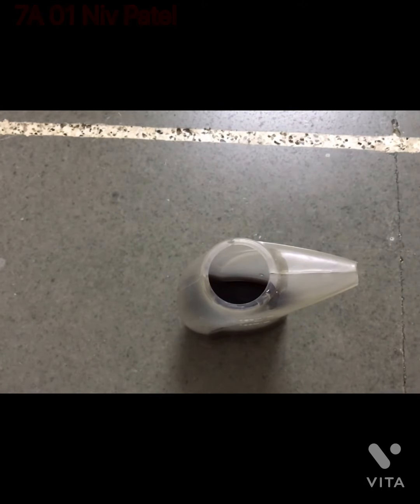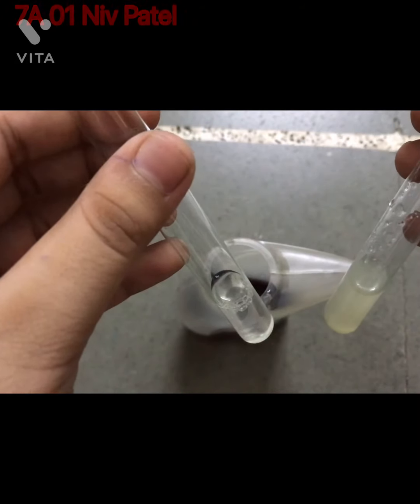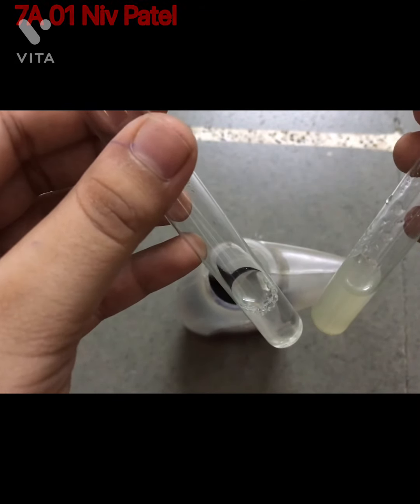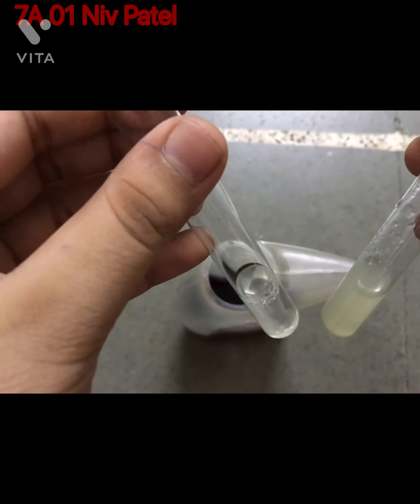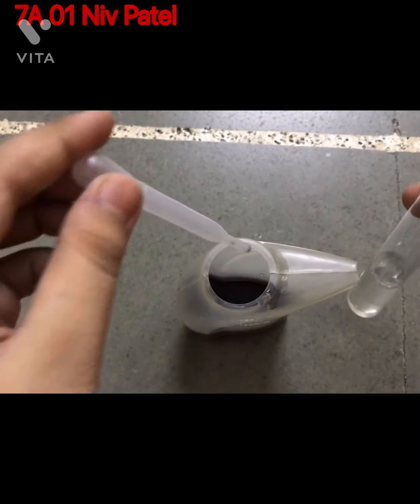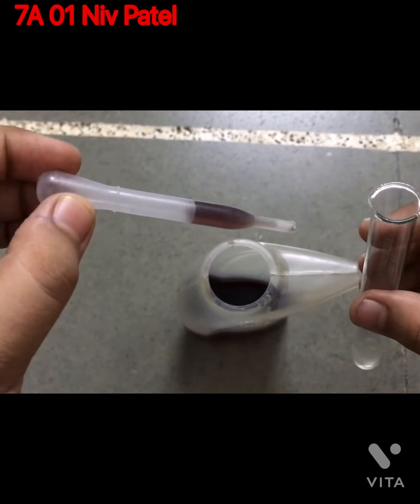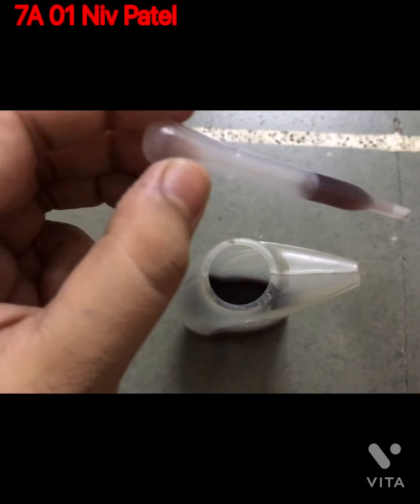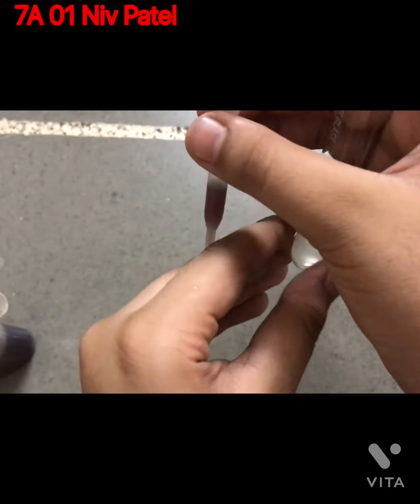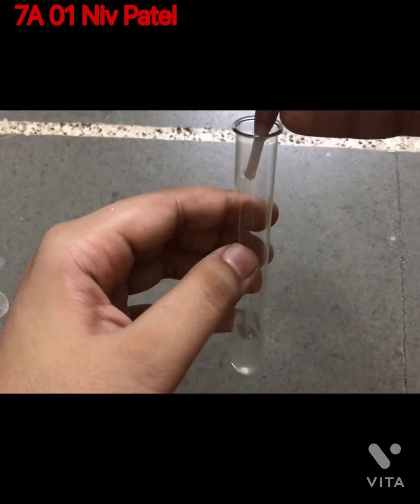I have filled two test tubes — one with soap solution and another with lemon juice. We will test both of them with our China Rose solution one by one. Let's first test the soapy solution. Take a dropper, fill it with the solution, and add about three to four drops of our China Rose solution.